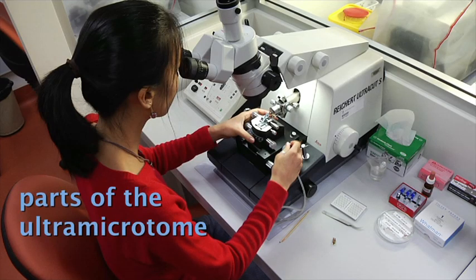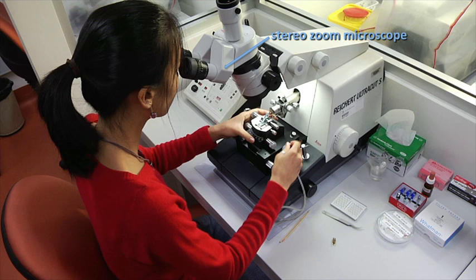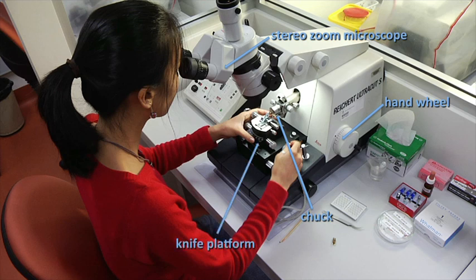Parts of the ultramicrotome: stereo zoom microscope, hand wheel, chuck, knife platform, and electronic control panel.